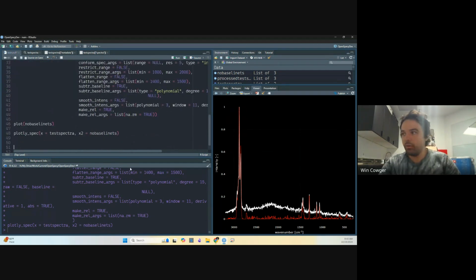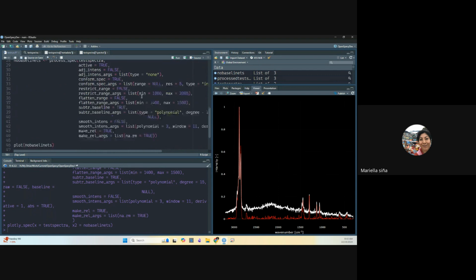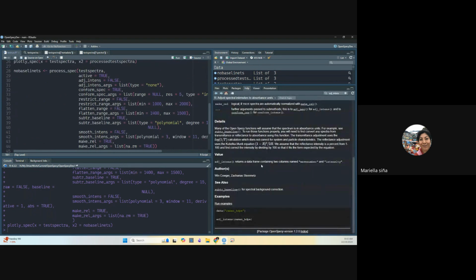All right. So the next thing we want to do, I see a hand raised. Sorry, I just wanted to make sure because I did get lost. Where did you get the parameters from? Did you just copy and paste them from somewhere? Oh, okay. Great question.